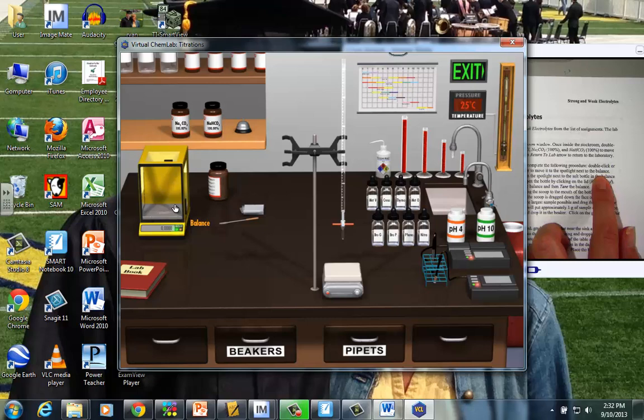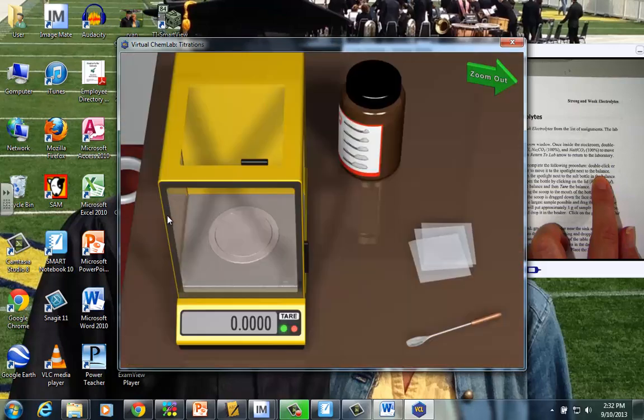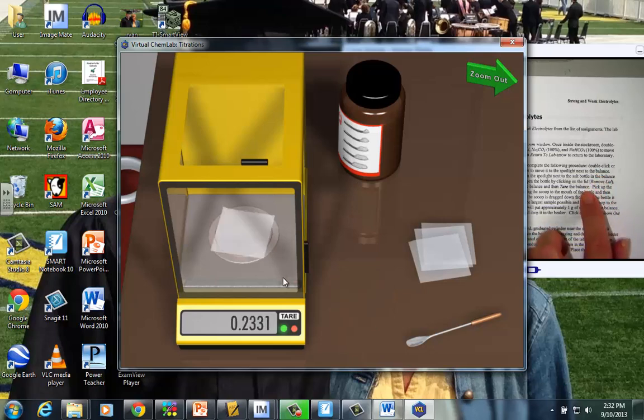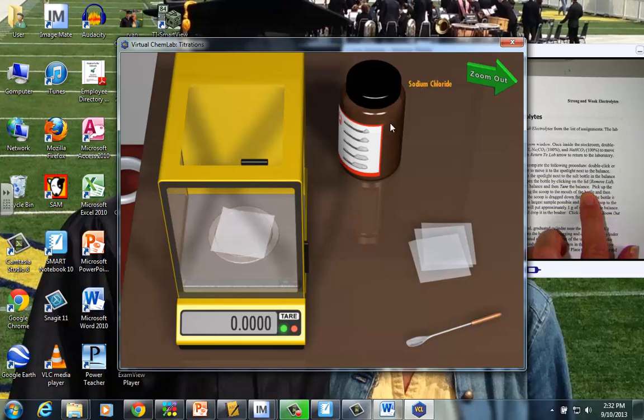I want to zoom in on the balance, so I just click on it, and it should make the balance come up a little bit bigger. I'm going to take a little piece of weighing paper, and just click and drag to the scale. And the directions tell us to tare the balance. That's just a fancy word for zeroing the scale. So we've zeroed the scale, taring the balance.